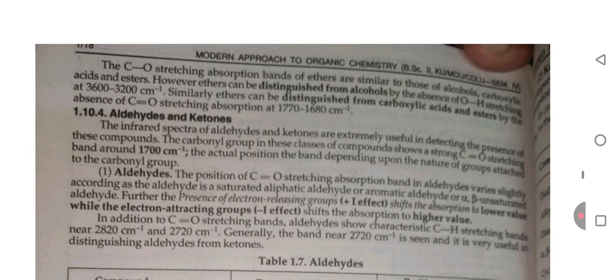The C-O stretching absorption bands of ether are similar to those of alcohol, carboxylic acid, and ester. However, ether can be distinguished from alcohol by the absence of OH bond stretching at 3600 to 3200 cm inverse. Similarly, ether can be distinguished from carboxylic acid and ester by the absence of C double bond O stretching absorption at 1770 to 1680 cm inverse.